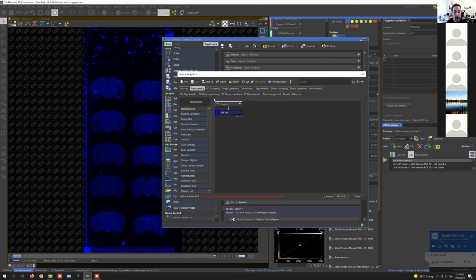Something simple like that is actually quite easy to build in here. And the good thing about general analysis over jobs is they have a search. So if you're really having trouble finding things, you can just search for them and find them.